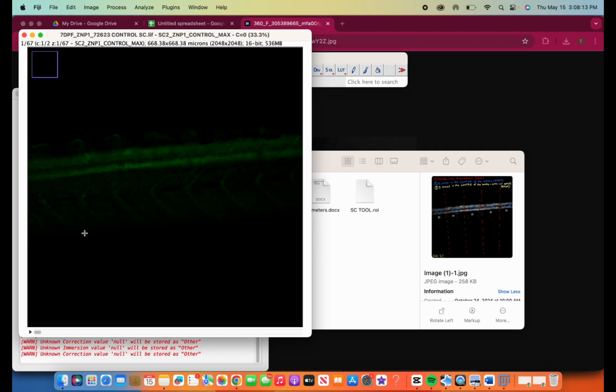Now, before we condense it, we need to make sure that everything that's being condensed together is something of value. So in this case, I'm quantifying the spinal cord, right? I want to make sure that all of the images that I'm condensing into this sum are images that are going to give me a clear reading of each part.